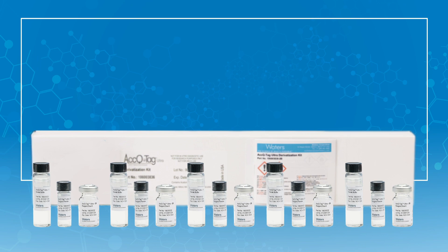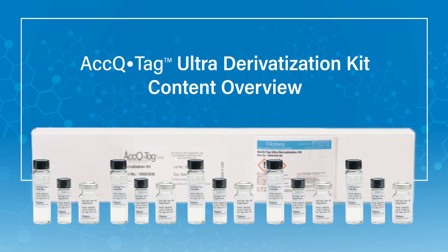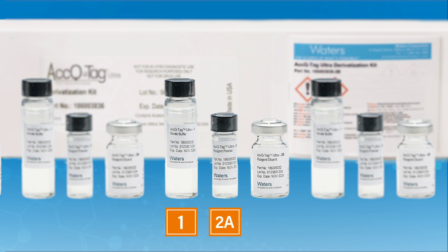First, let's review the AccuTag kit contents. Each set of reagents includes one vial each of AccuTag Ultra Borate Buffer, labeled as vial 1; the AccuTag Ultra Reagent Powder, which is vial 2A; and AccuTag Ultra Reagent Diluent, vial 2B.